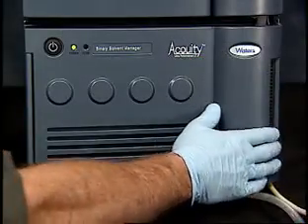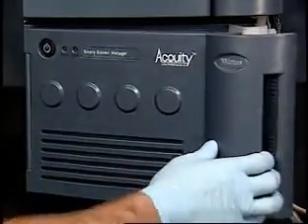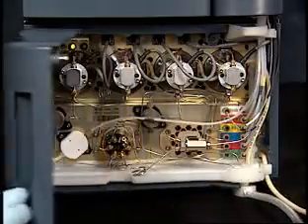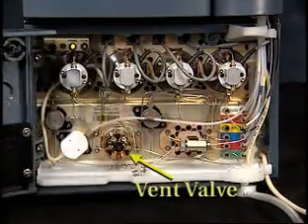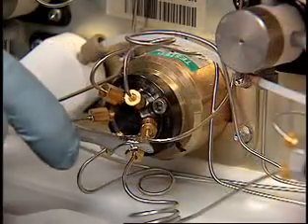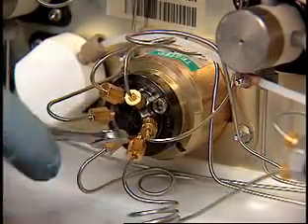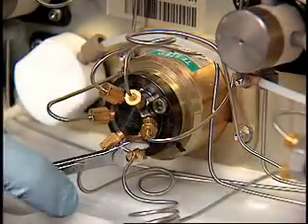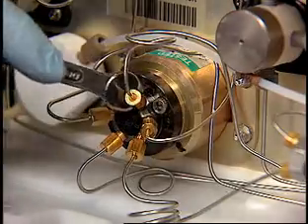Next, open the door and locate the vent valve. Disconnect the tubing connections from the ports, noting where they originate.